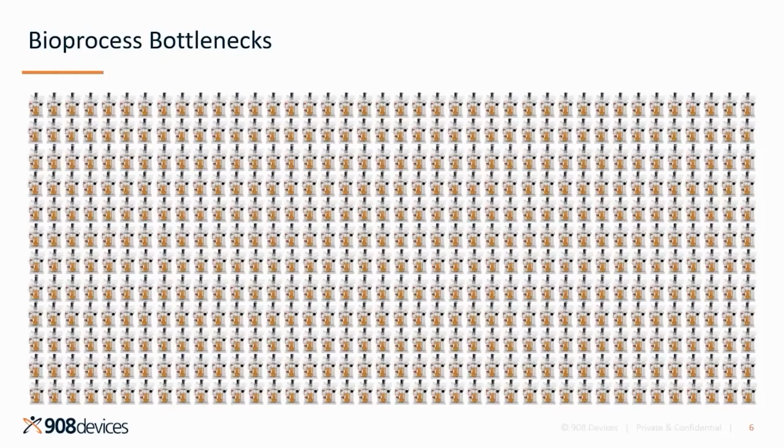These challenges are not shared during scale-up or in a manufacturing setting where the number of bioreactors is much smaller and the volume of media to sample from is substantially higher.